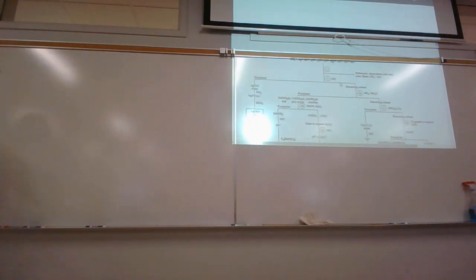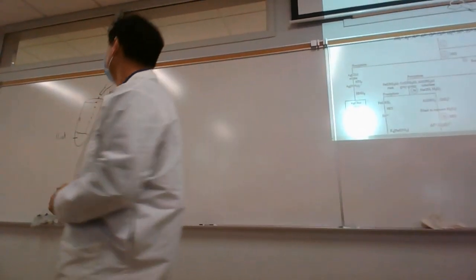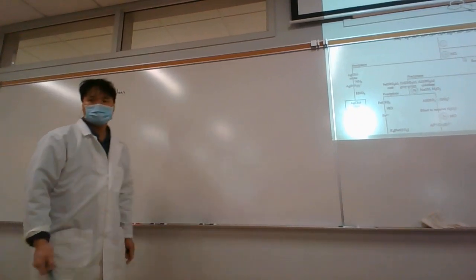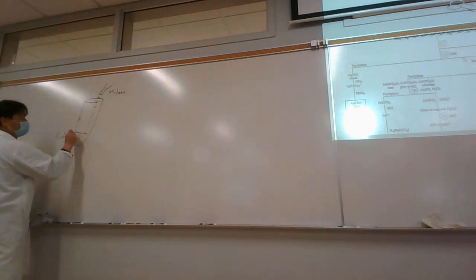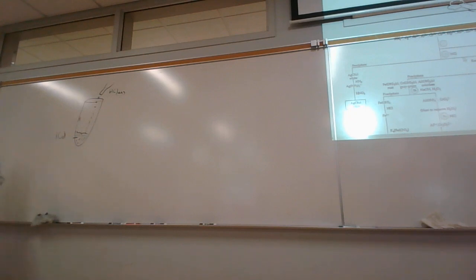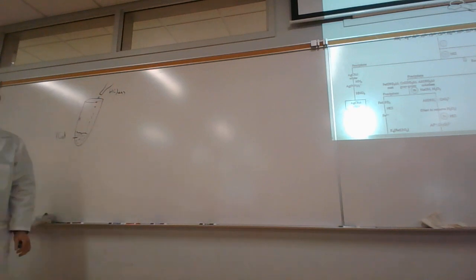we'll have this drop by drop here. And what's going to happen is the solution is going to get really cloudy with precipitate. It's going to get so cloudy, you can't tell if you're forming more precipitate or that's it. What you're looking at is you want to keep adding it, and if it continues to form more cloudy precipitate, you keep adding it until it stops. But it's hard to see.